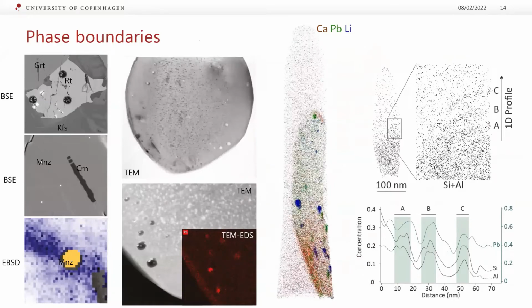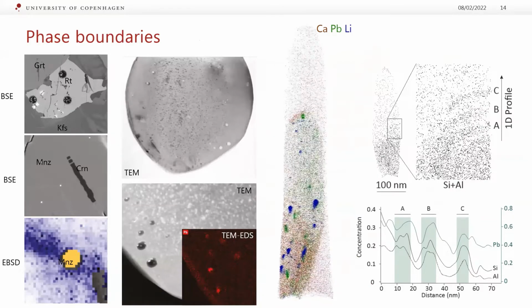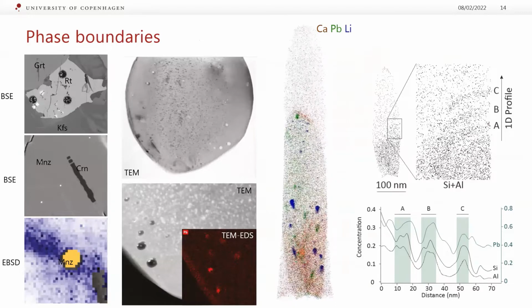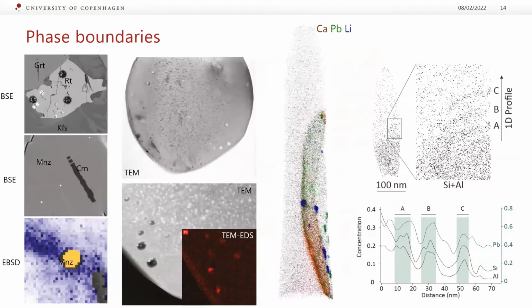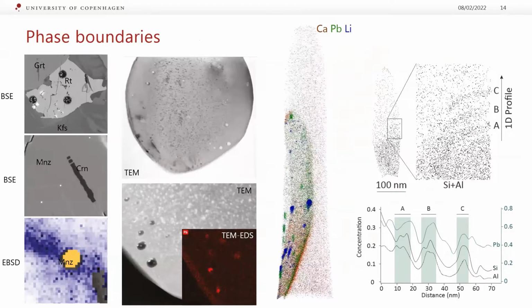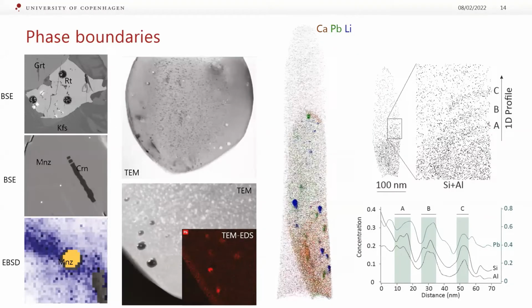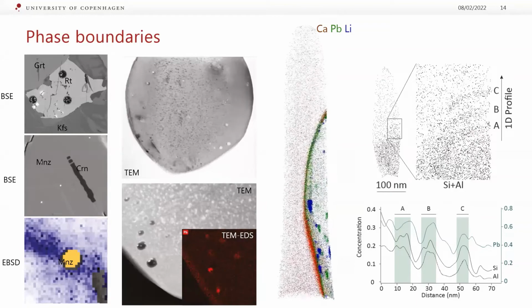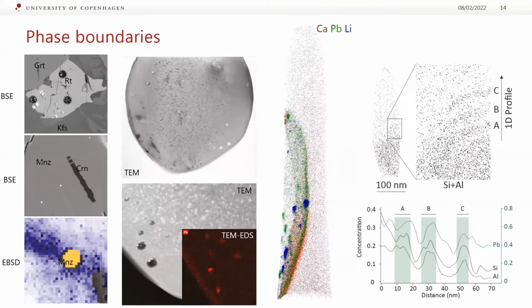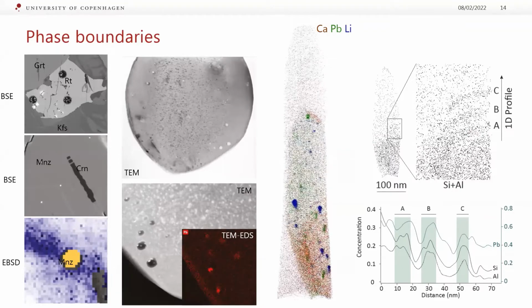The monazite inclusions are around 500 nanometers wide. We did TEM images that show the whole world of complexity. In this case, we also made an Atom Probe needle out of this. We captured mainly the rim, but you can see different kinds of inclusions within this. Atom Probe Tomography allows us to very specifically measure the concentration of these and visualize it. We can see that the boundary itself is denser at the bottom than at the top.